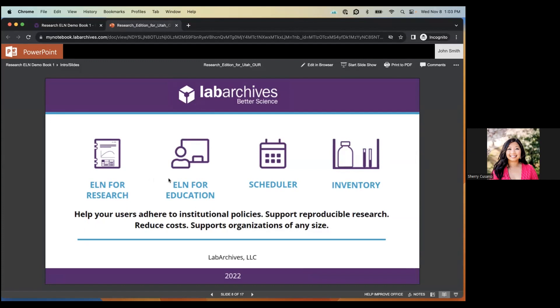We know a lot of instructors and students use both the research side and the education side. The classroom side is more equivalent to having a course notebook or lab notebook, where each student gets their own version of that notebook. We also have the Lab Archives Scheduler, which is a scheduling tool for resources, and Lab Archives Inventory, a tool for keeping track of items in your lab. I'm happy to show you any of those other products at the end as well.